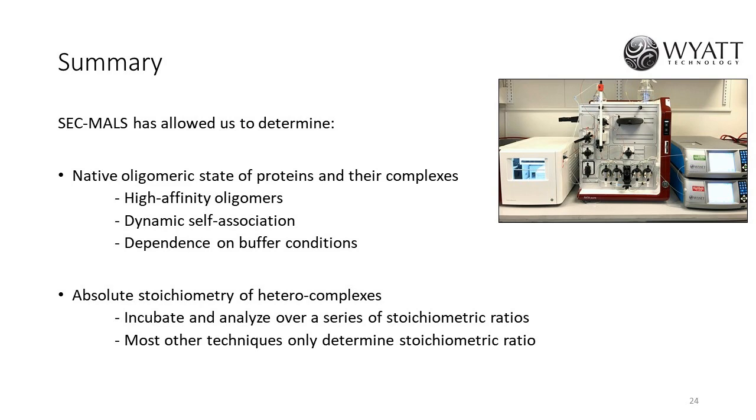Thanks. What factors should be considered to lower the error percentage with the molecular weight obtained from SEC-MALS? The easiest way to have good, nice errors with your molecular weights is to equilibrate the column as well as the SEC-MALS system for a long time, from about 2 hours to sometimes even overnight. The longer the system is equilibrated, the better the baselines are, which reduces the error. As well, if you have a high protein concentration, your signal is much better compared to the noise.